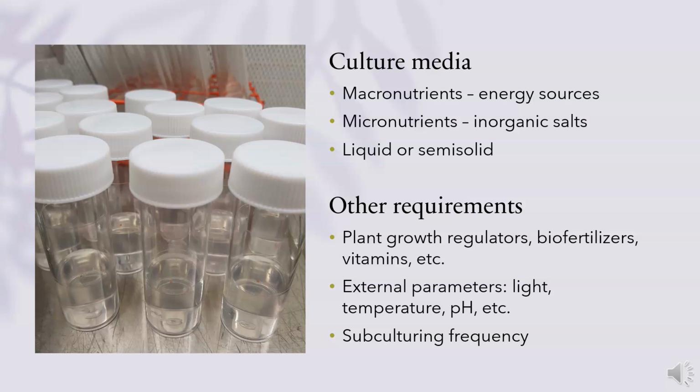External factors such as light, temperature, pH, and subculturing frequency also play crucial roles in successful tissue culture by supporting plant growth and tissue development.